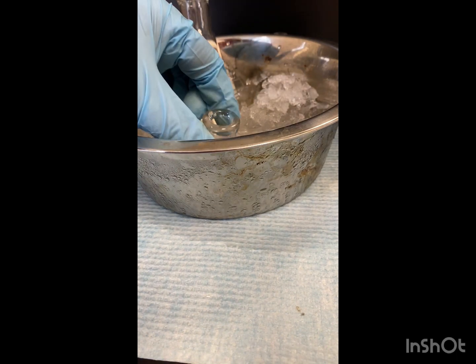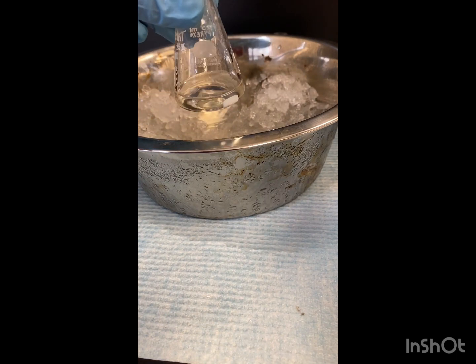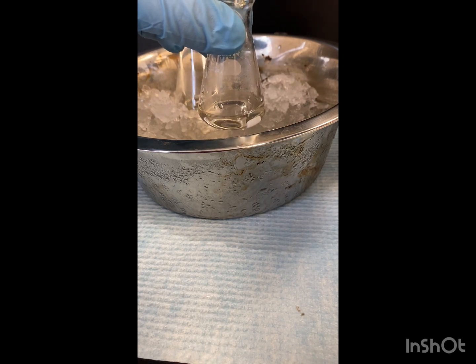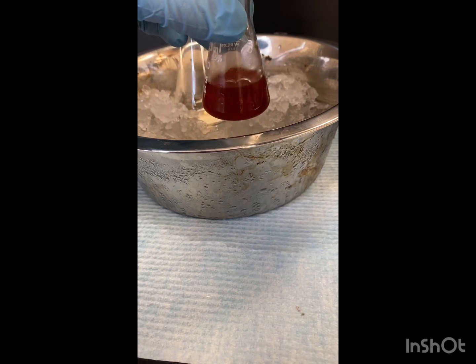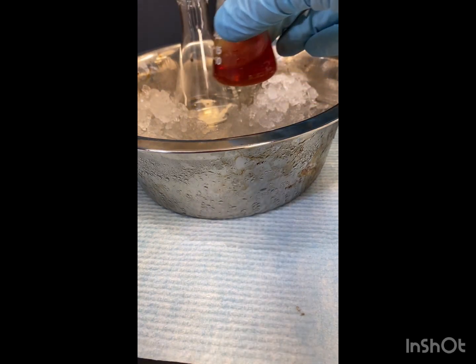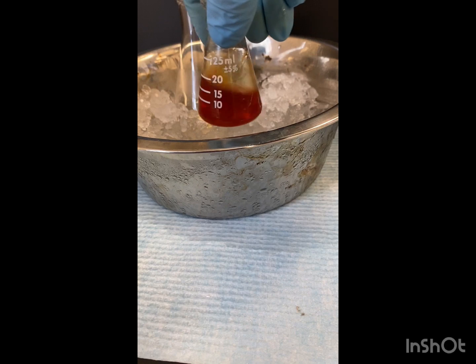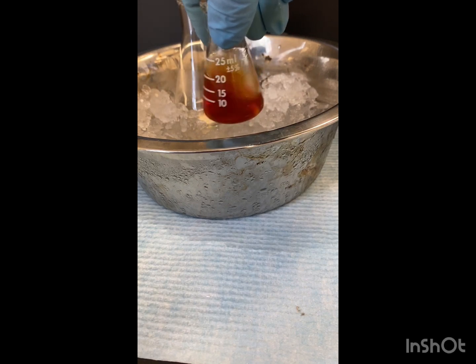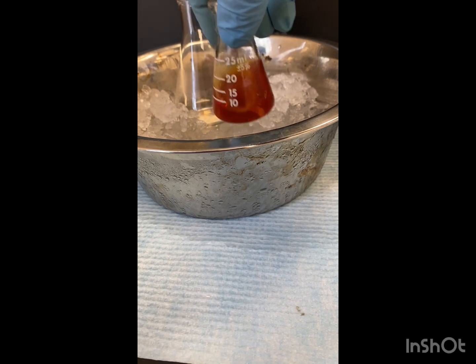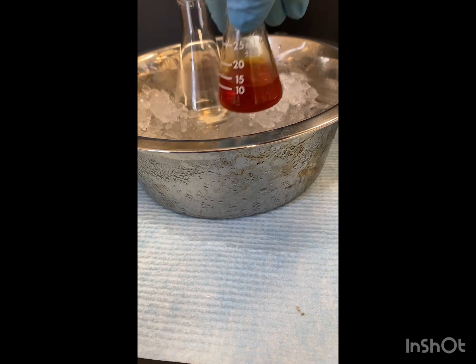Now that it's cold, we're going to add our bleach. We're going to stir it a little. Now we're going to let it sit for 10 minutes.